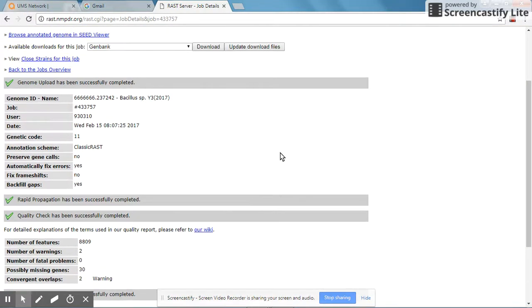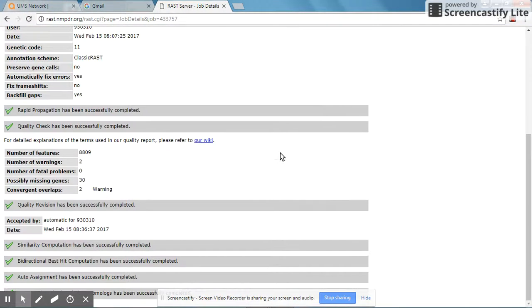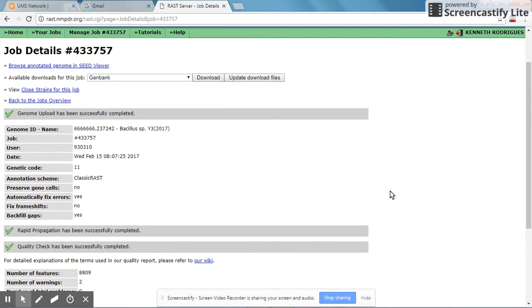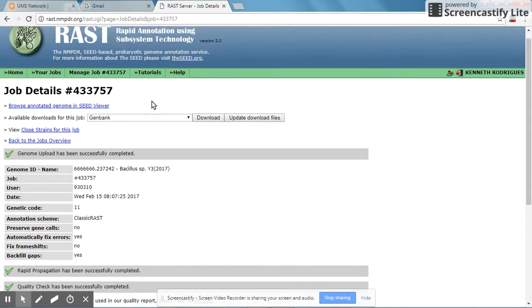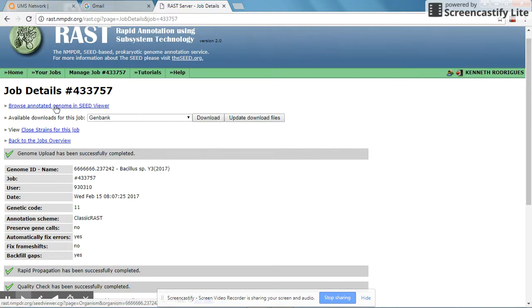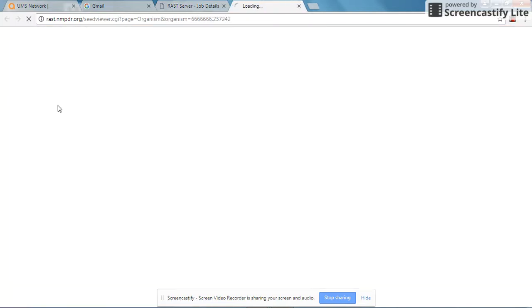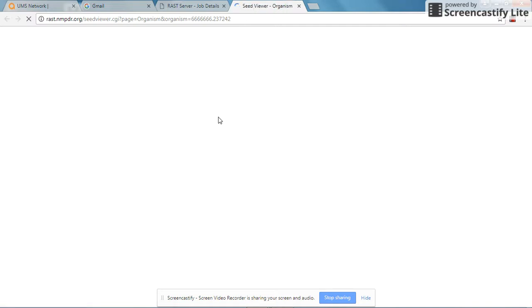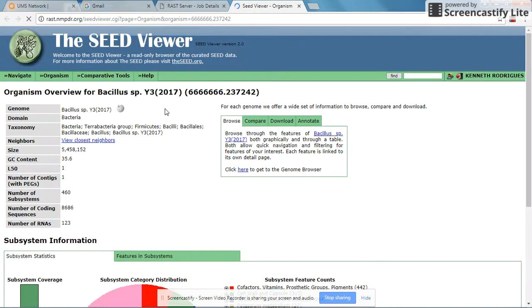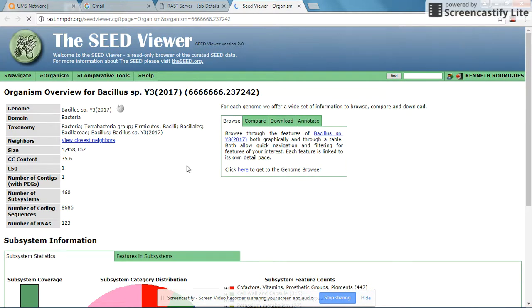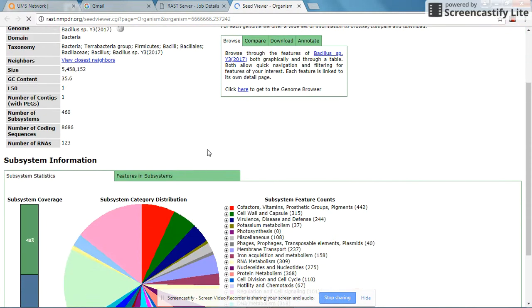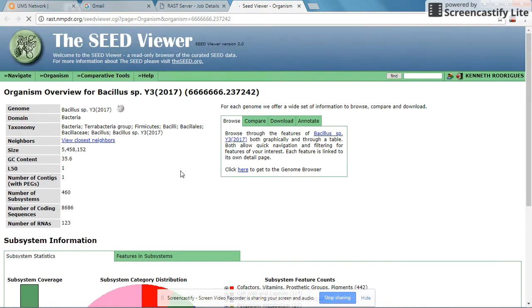For this demo, we are going to view the completed or annotated genome using the seed viewer. So to view your genome which has been annotated, you click on the seed viewer over here. We now have the annotated genome, which is a very good graphical representation here.